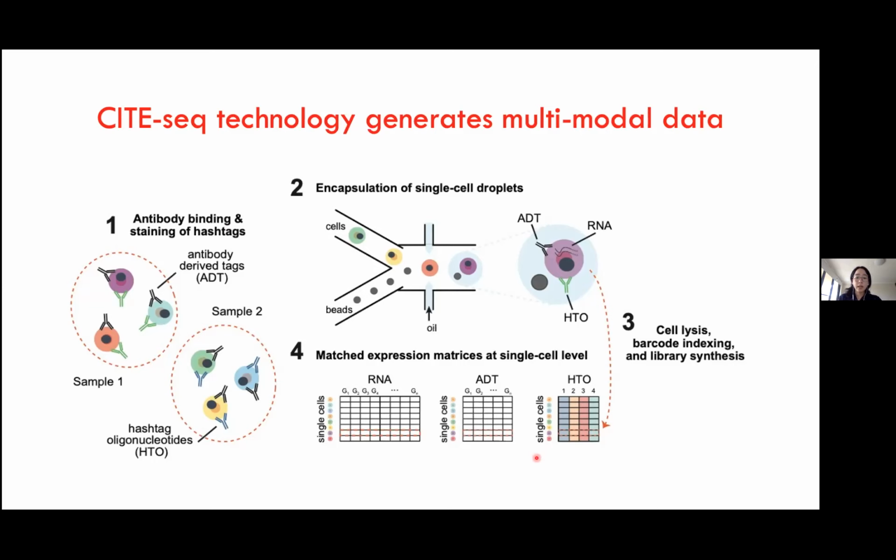And specifically, mRNA is profiled in the same way transcriptomes are profiled in a regular microfluidic experiment. But to obtain the cell surface protein expression, an extra step is performed before cells are loaded onto the 10x machine, which is cells are stained with antibodies against a specific cell surface protein, incubated and then washed prior to sending them through the microfluidic channel.